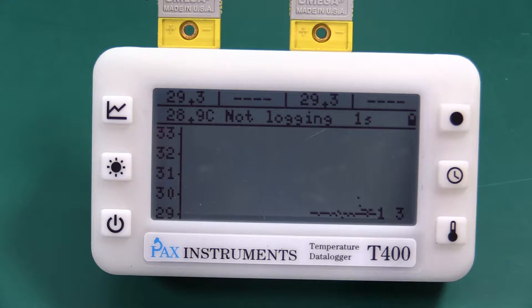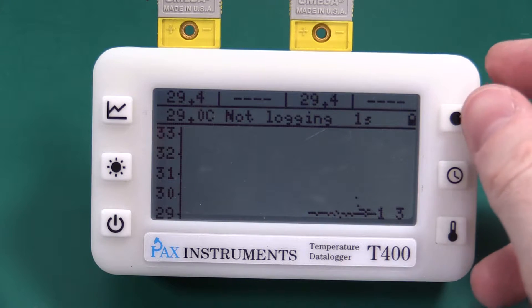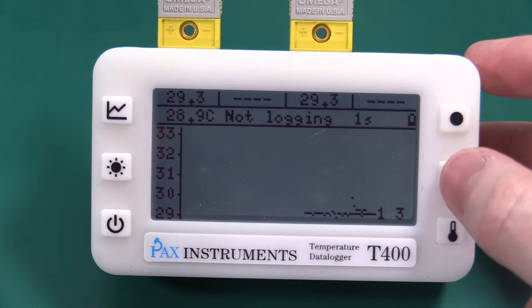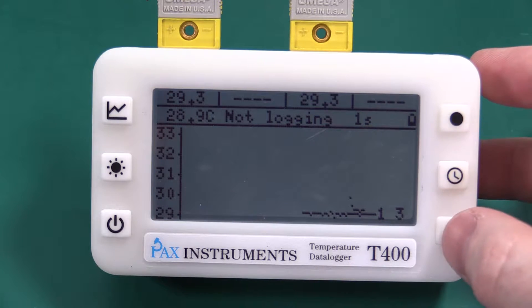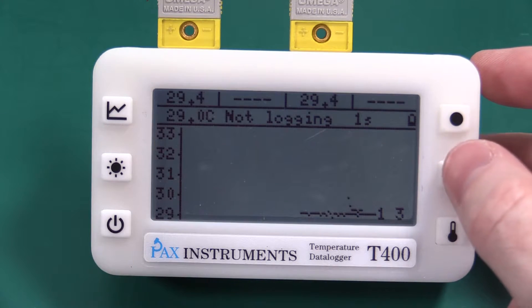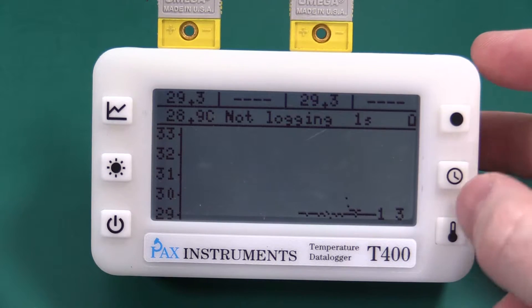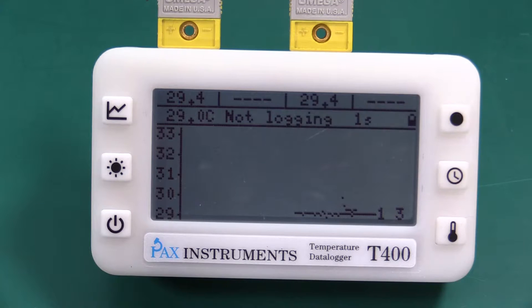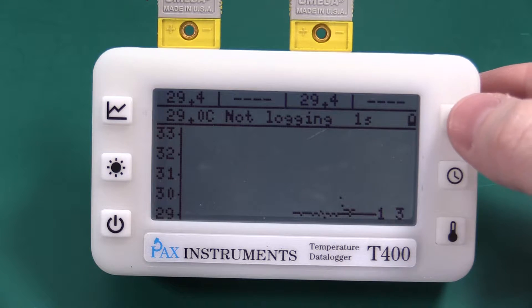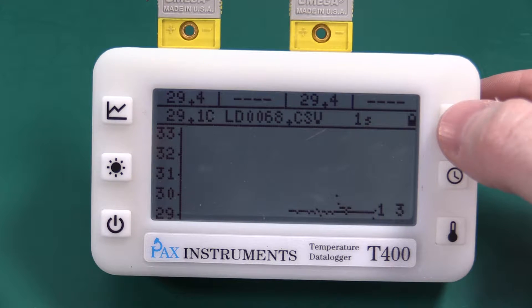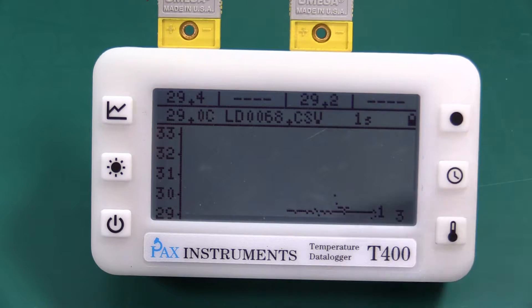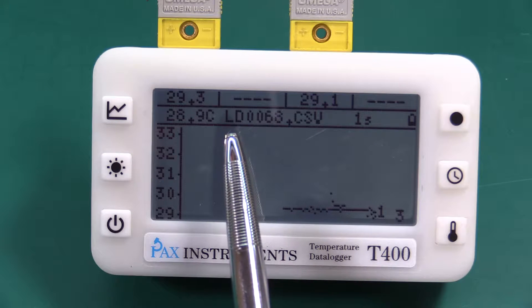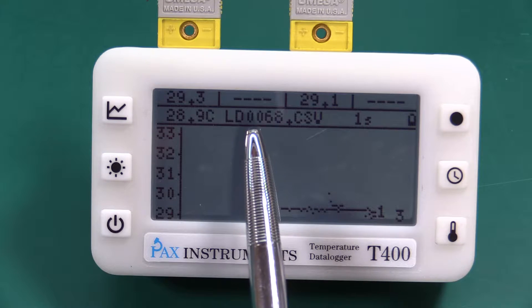If we want to start logging we just set our time base, set our units, we'll do one measurement per second in celsius. We'll hit record and now it tells us what our file name is.